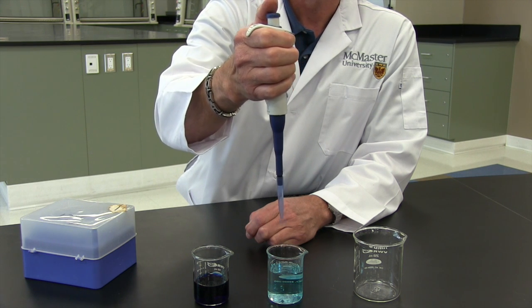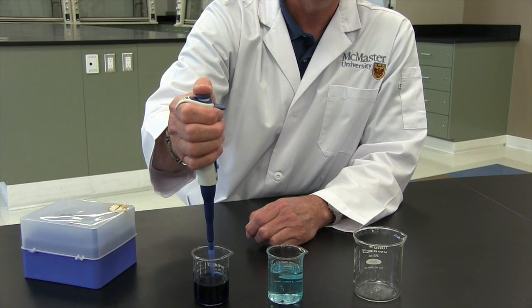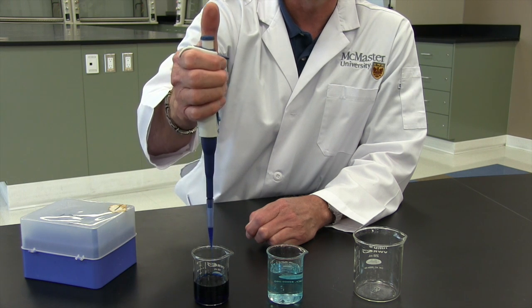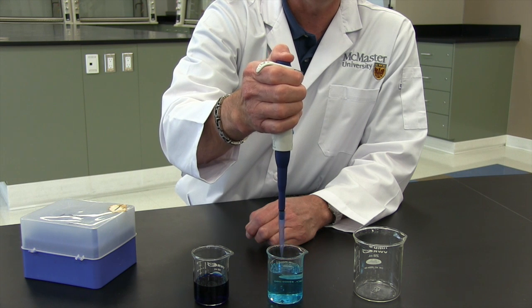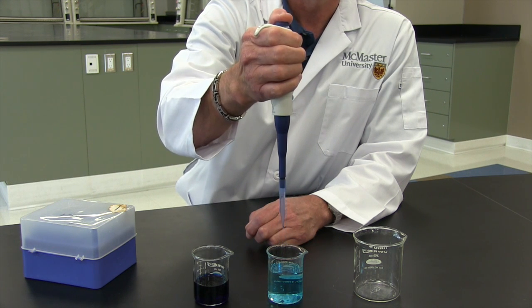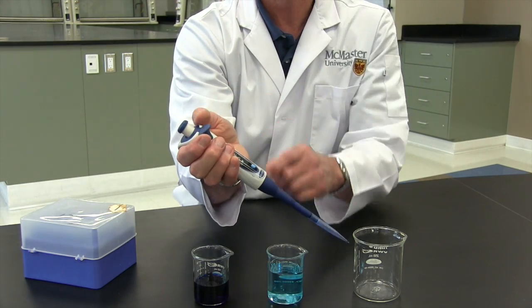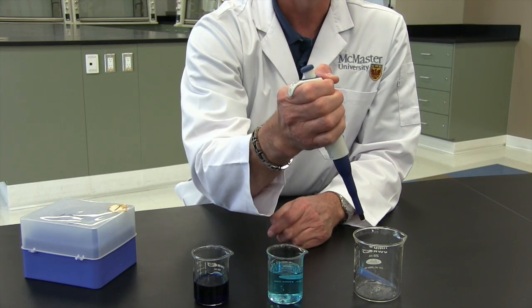So again, the format is press down to the first position, go under your liquid, draw it up, out and over to where you want it to go, and then press down to get rid of it, and then out. And when you're done, this is the tip dispense button. Eject into your waste container.